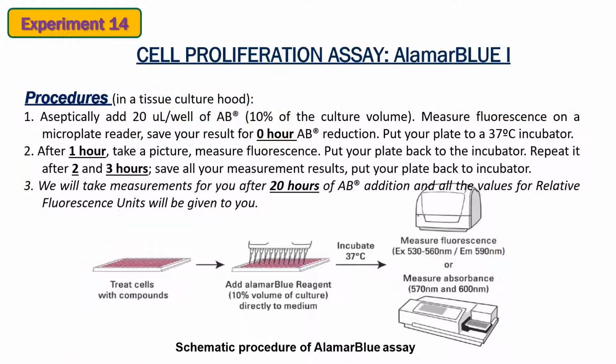So we're coming back to the lecture. You add these 20 microliters of Alamar Blue, and it's only 10% of your final volume. So you go and check your fluorescence or absorbance. Doesn't matter, because you could use 600 nanometers for the colorimetry. And in this case, you still get very sensitive results for your research, for your proliferation assay. But of course, measurement of fluorescence gives you a much higher resolution than spectrophotometry.